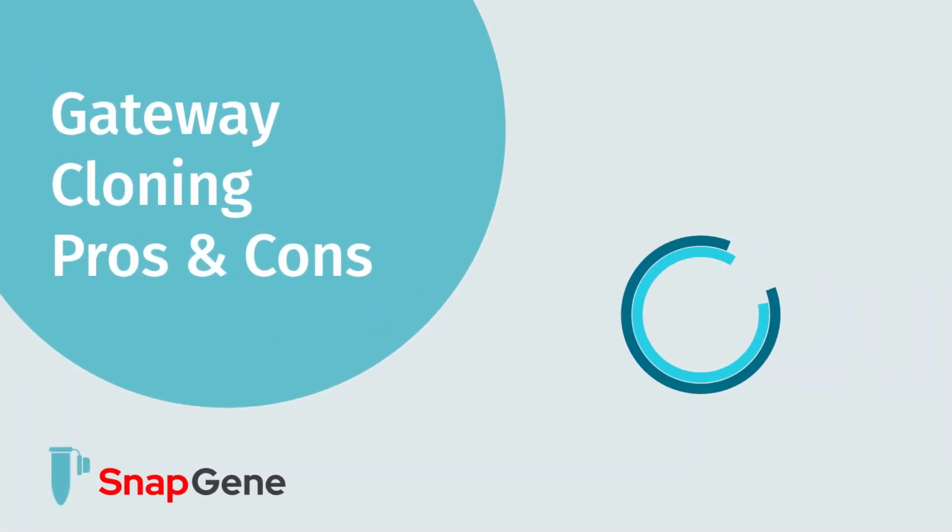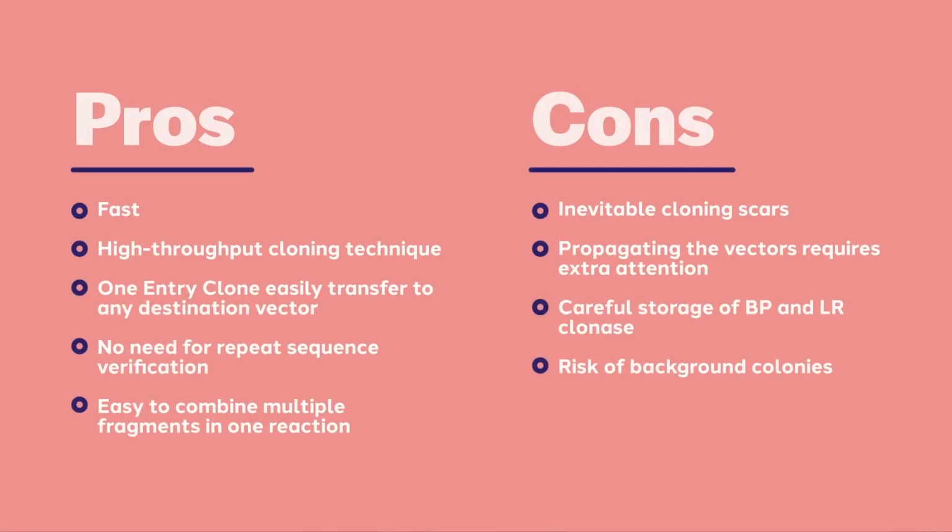In this video, we are going to discuss the relative advantages and disadvantages of gateway cloning. The pros and cons of gateway cloning are summarized here. We will discuss them one at a time.